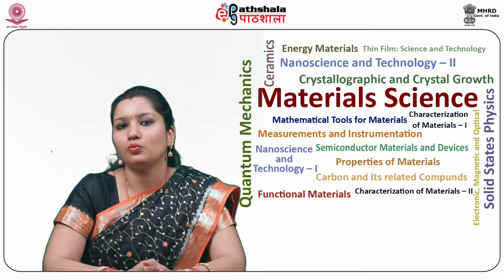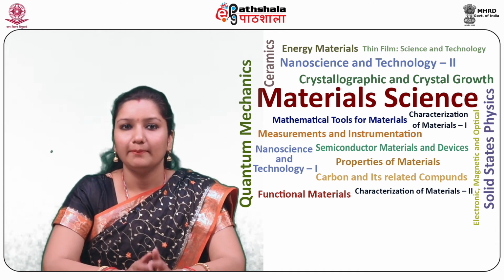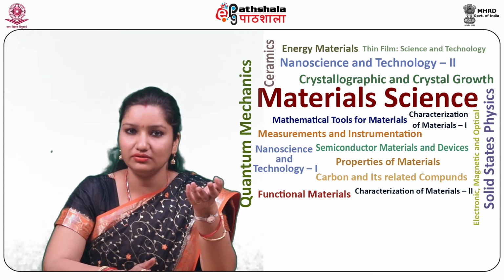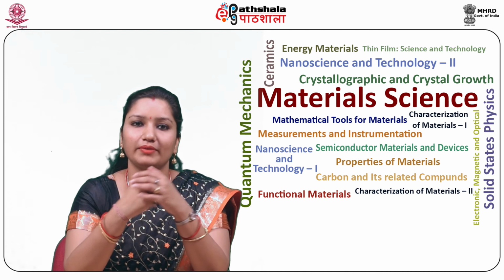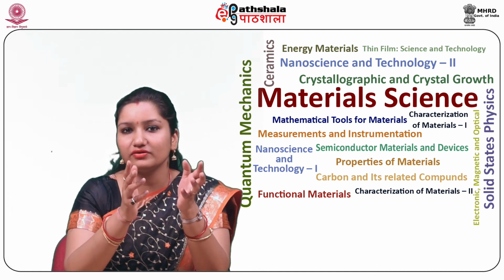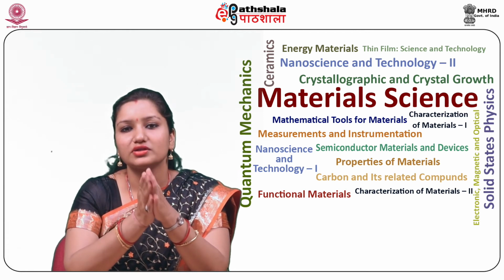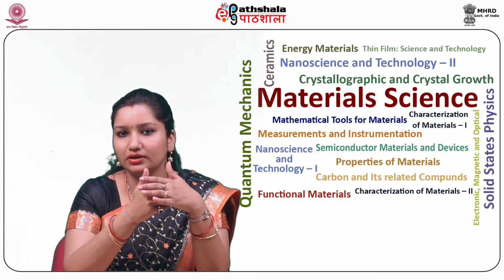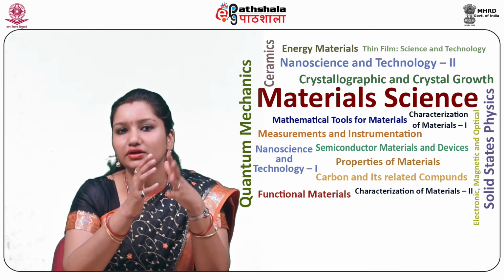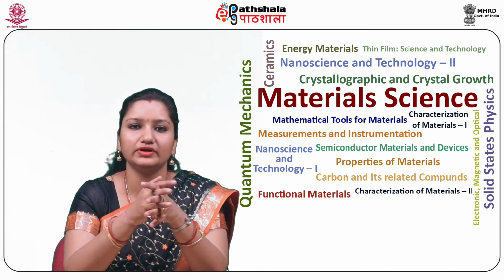Now let us see what is actually X-ray diffraction. The phenomenon of X-ray diffraction basically is an interaction between X-rays and the geometry of crystals. For many years, crystallographers had accumulated knowledge about crystals, chiefly by measurement of interfacial angles, chemical analysis, and determination of physical properties, and there was little knowledge of interior structure.